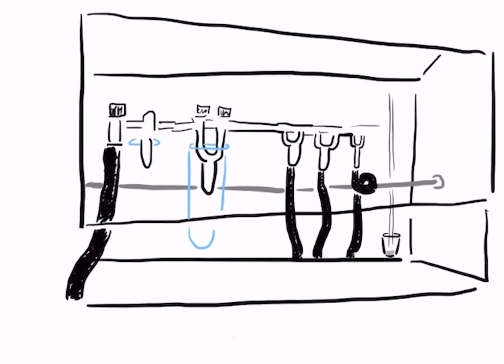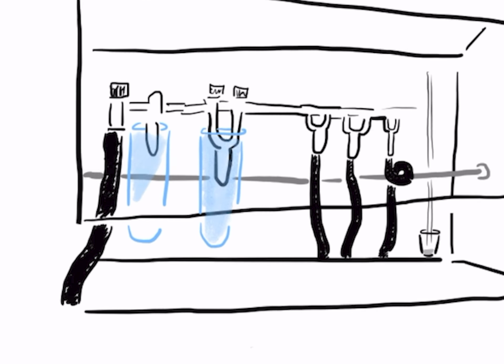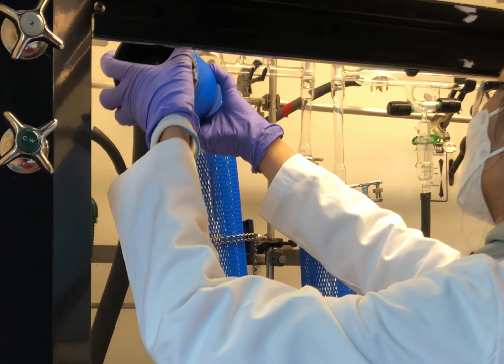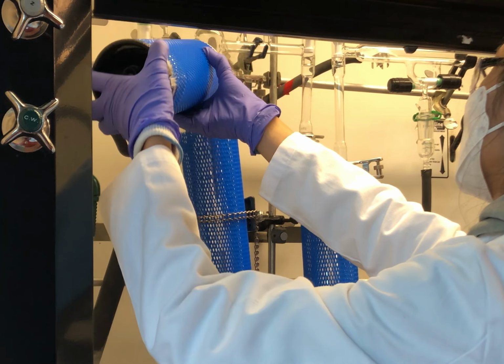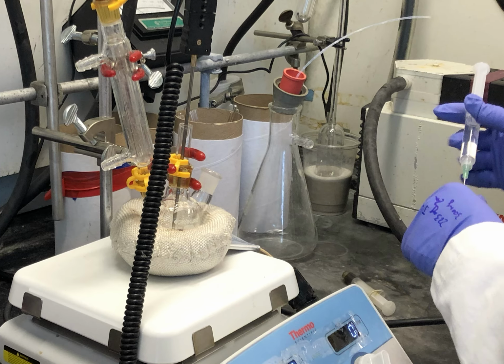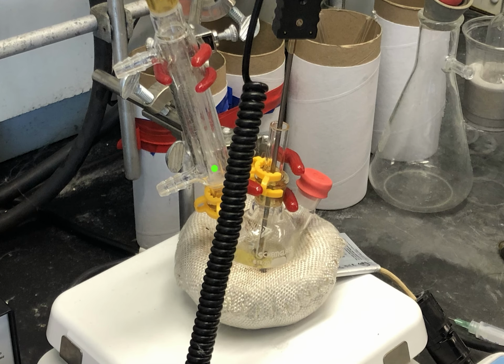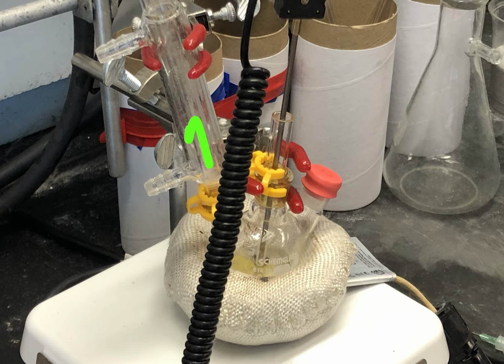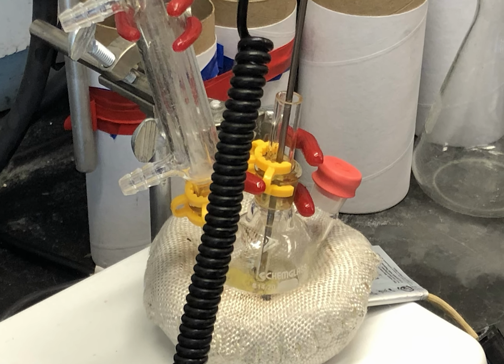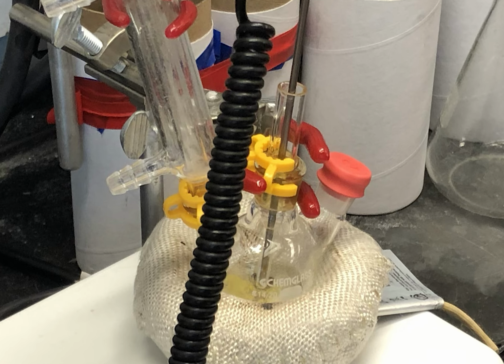On the Schlenk line, we set up some liquid nitrogen traps, which would freeze any solvent to prevent it from getting sucked into the vacuum while air was being pulled out. We added in the reagents to the 3-neck round bottom flask, then pulled vacuum or degassed the system to remove any air that could have gotten in while we sealed the setup or transferred the reagents from the glove box.